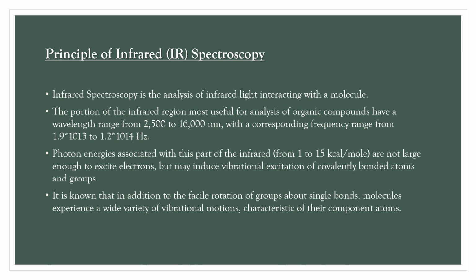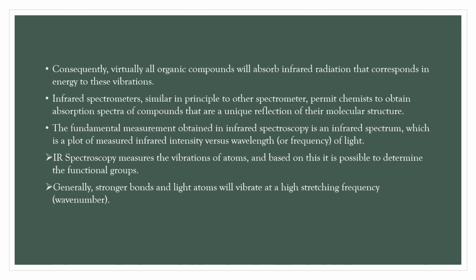It is known that, in addition to the facile rotation of groups about single bonds, molecules experience a wide variety of vibrational motions characteristic of their component atoms. Consequently, virtually all organic compounds will absorb infrared radiation that corresponds in energy to these vibrations.